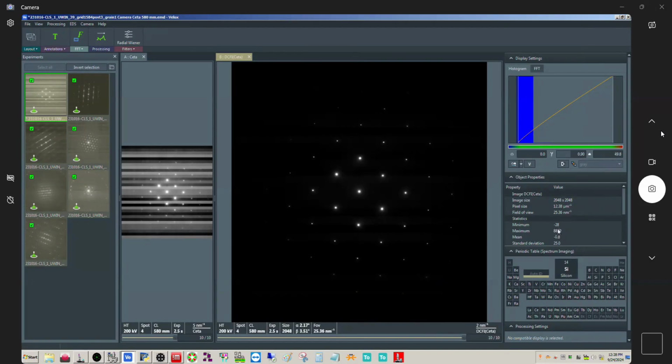That's the point though, right? This is a very high dynamic range situation, where you've got a large difference between your maximum and your minimum in the picture. So in a high dynamic range application, the histogram is not going to be remotely close in terms of telling you the maximum counts. It may be closer in terms of the minimum. This is telling us a negative value for some reason, but in terms of an absolute difference, that's only a 28 count difference. In terms of the maximum difference, though, that's huge.